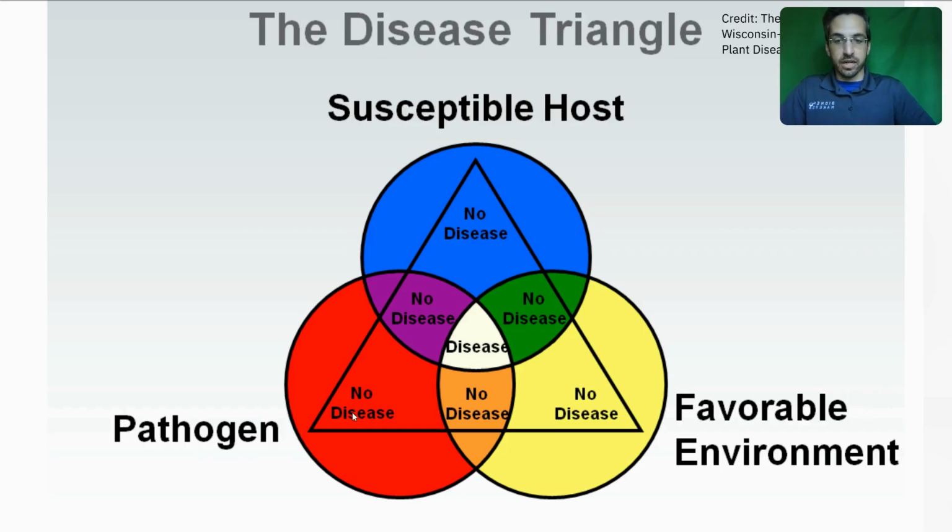So what we're reporting here in that first section is the pathogen piece. It helps to know if the enemy is at the gates. That does not itself translate to you're guaranteed to get this disease. It means we should be aware of what conditions lead to this disease infecting. When does it become virulent? When in the season? We need to be scouting this area, use this information to inform scouting or rotations or seed traits.